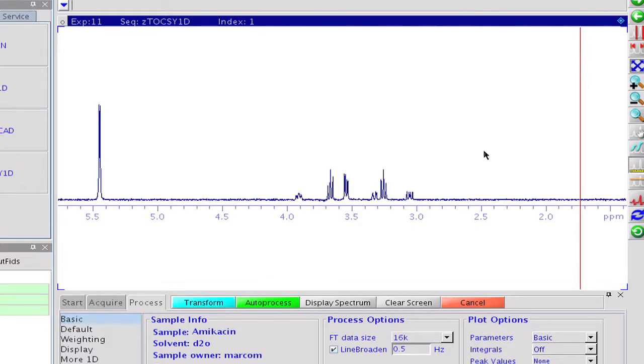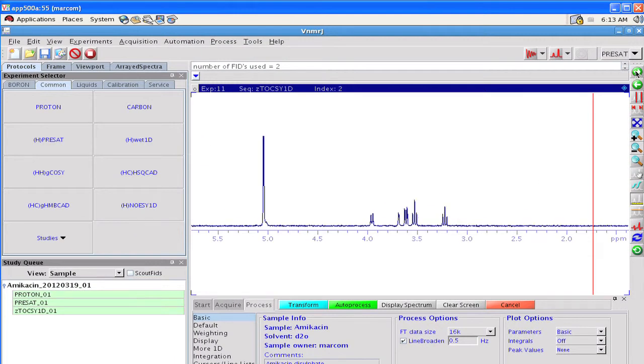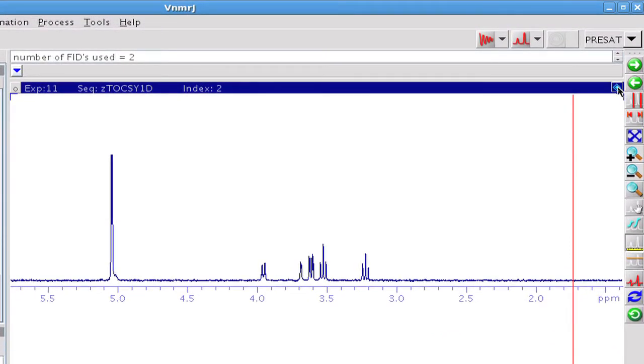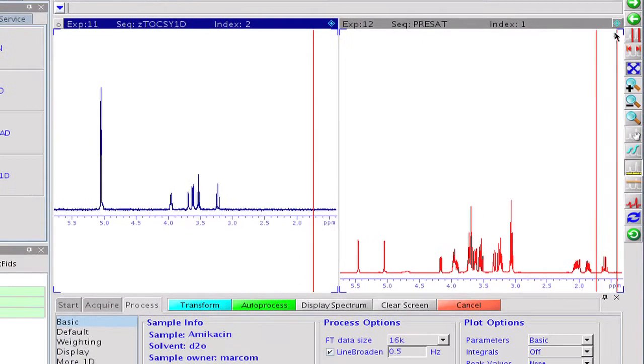A renewed Fourier transform makes the second sugar subspectrum accessible. In the remaining acquisition time, we can prepare for an overlaid display between the original proton spectrum and the set of 1D Toxy spectra.